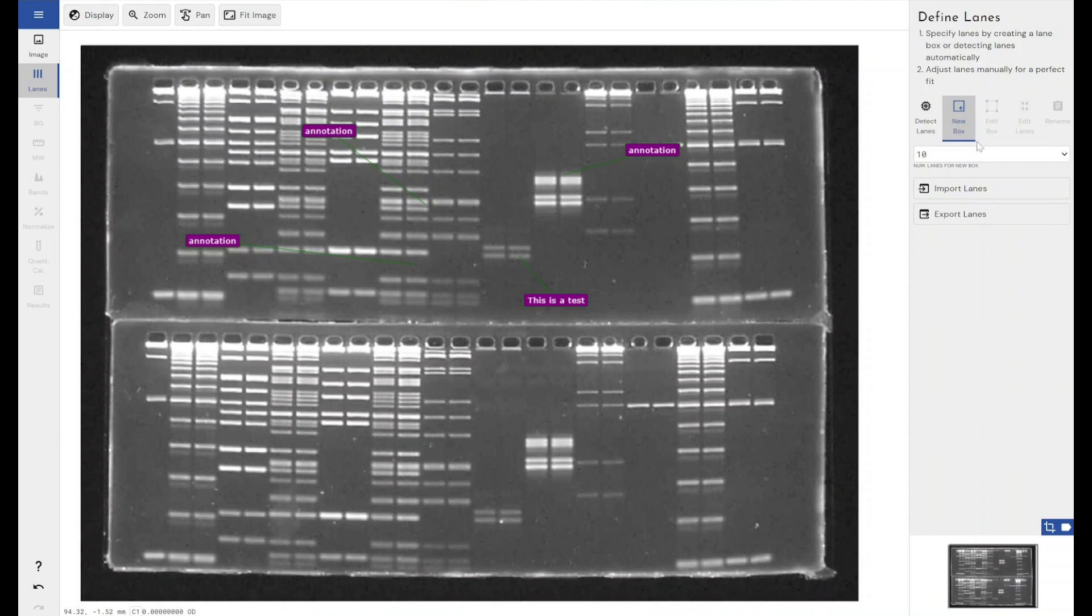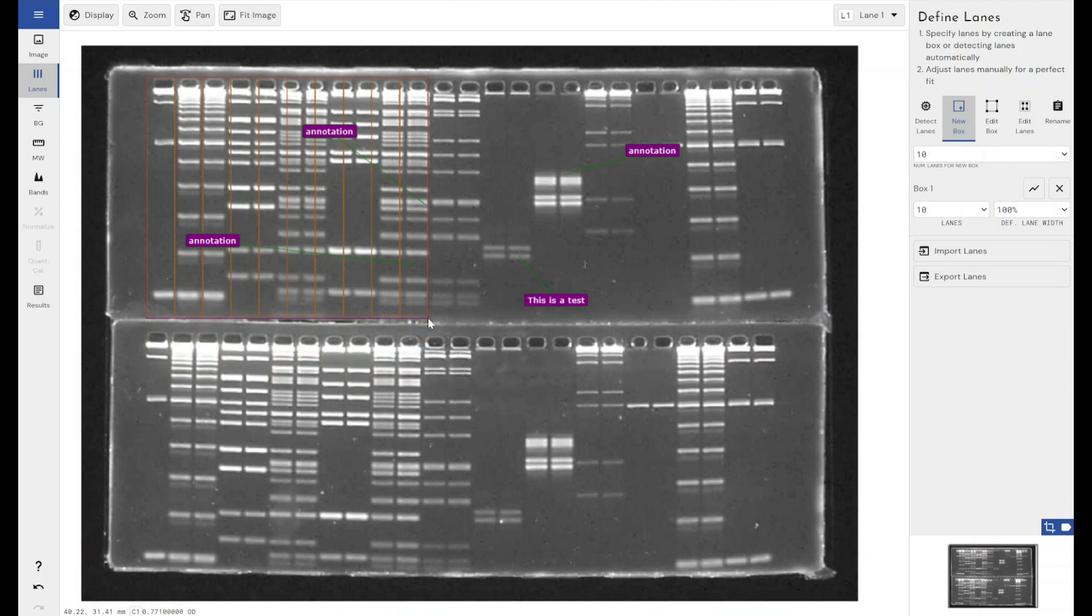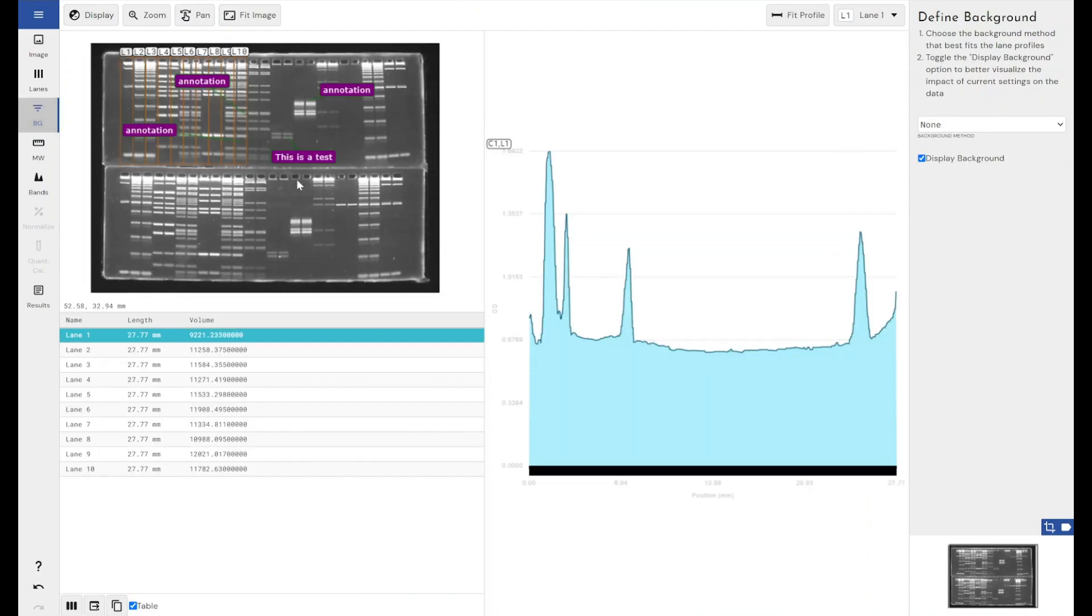I'm just going to add some basic lanes to get me through to the bands mode, and then I'll show you how to annotate actual data from our lanes. That's adding annotations to our images.